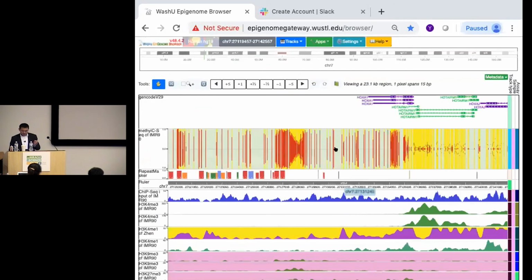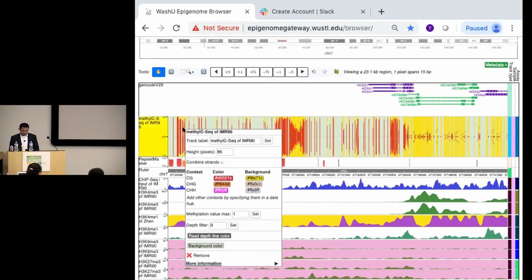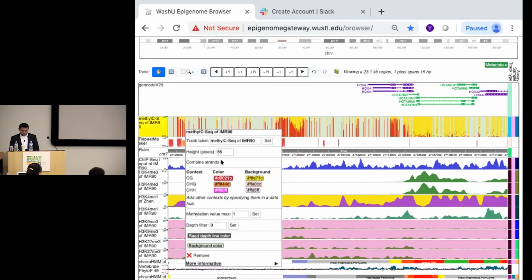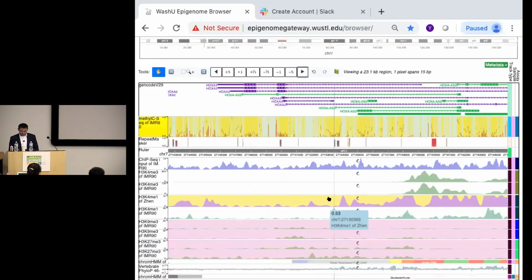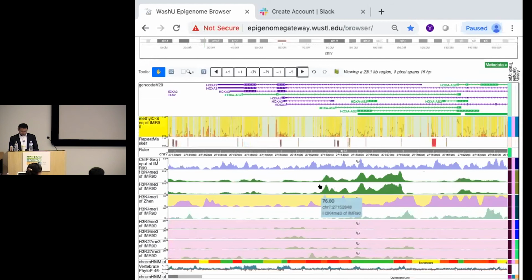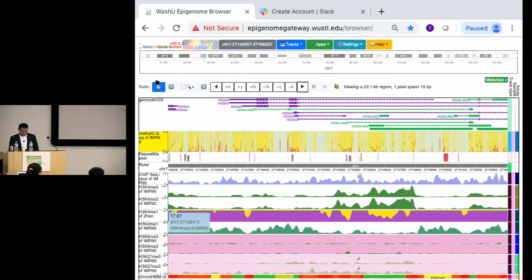So now I'm coming back here, okay? So I have an interesting view. I saved it, okay? I'll continue working on my browser in the same session, okay? So, okay, this is cool. So I'm going to now combine the tracks. I'm going to go to a different location.